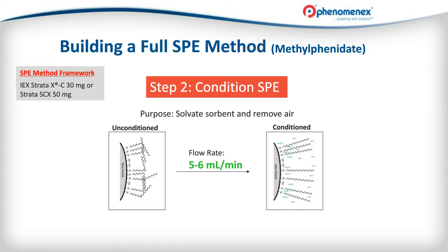And then most often, common practice for conditioning solvent is to condition with what you elute with. You don't want to be eluting off your analyte of interest and have that be the first time that you've shown the cartridge a strong solvent. So it's better to flush out any of the junk from the cartridge, whether it's plasticizers, so on and so forth, with the conditioning step, and not flush them out when you're trying to collect your analyte. So good common practice is to condition with what you elute with.